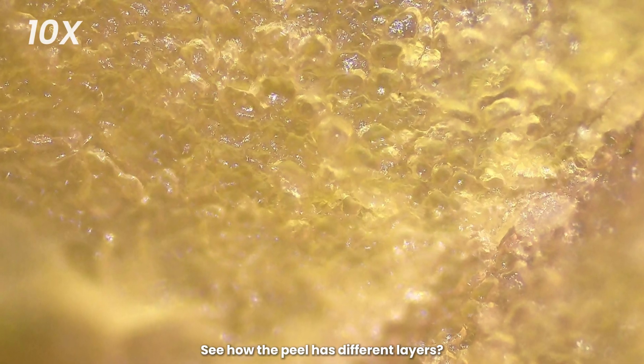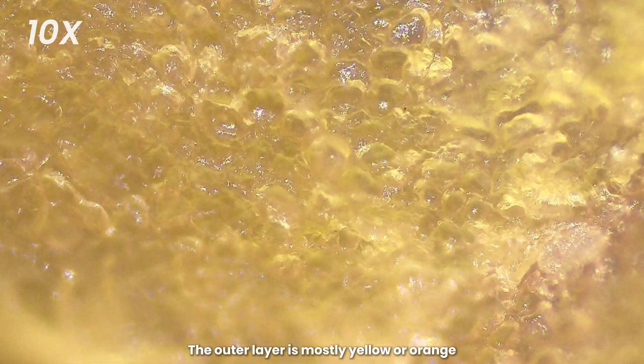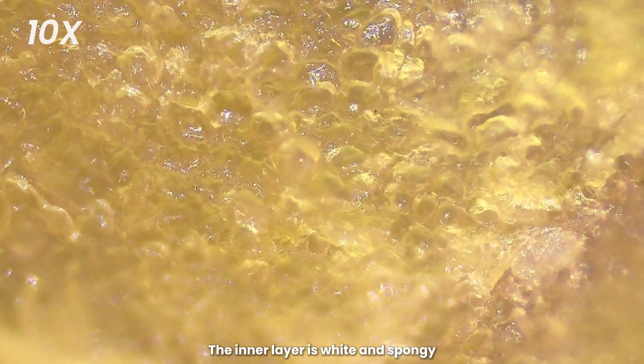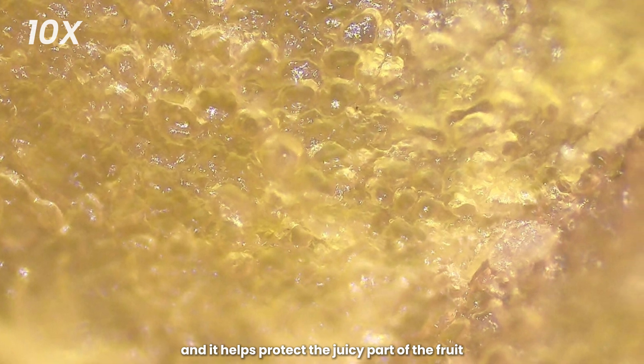See how the peel has different layers. The outer layer is mostly yellow or orange, and that's where most of the oil glands are located. The inner layer is white and spongy, and it helps protect the juicy part of the fruit.